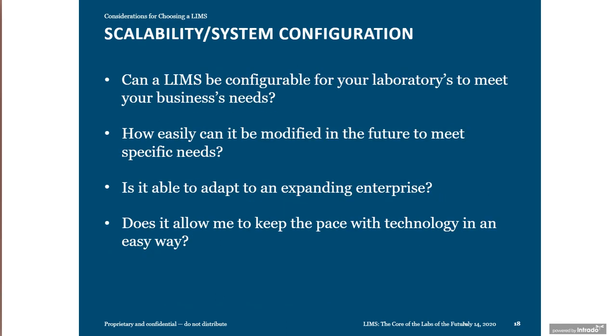Scalability and system configuration. Another important consideration is, can this LIMS grow with my organization? Because obviously you're going to expand, you're going to release more products, you may acquire another site. Is this system scalable?